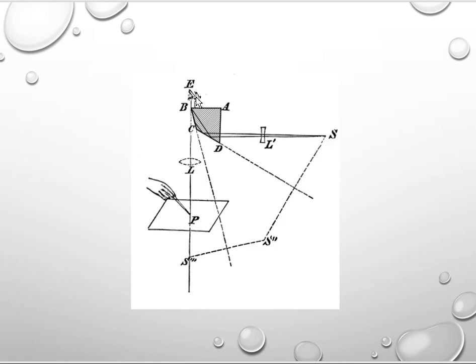This is the ray diagram, like this is the eyepiece you are looking from here. So when the observer is looking, the angle is drawn in such a way that his hand is seen in the camera lucida but he is working on the paper.